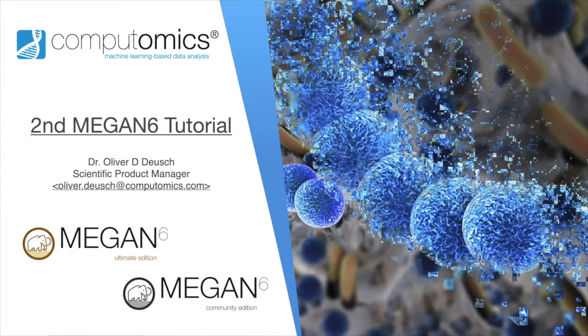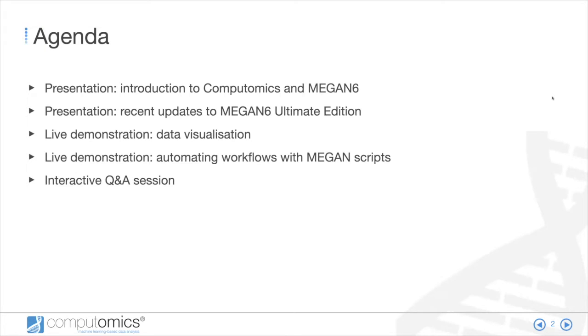Thanks, Simone. So yeah, welcome again from my side. Happy to host this second tutorial. As Simone said, the first one was quite a good success. I think we've had more than 800 views on YouTube now. So it's proven quite popular. There's definitely demand, and this is why we're doing a second one now. Yeah, without further ado, let's start with the tutorial.